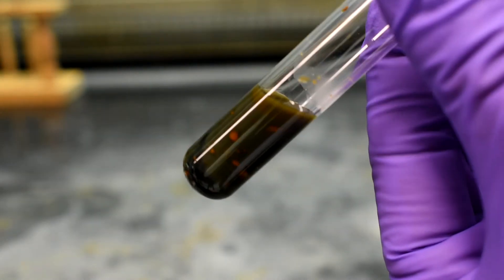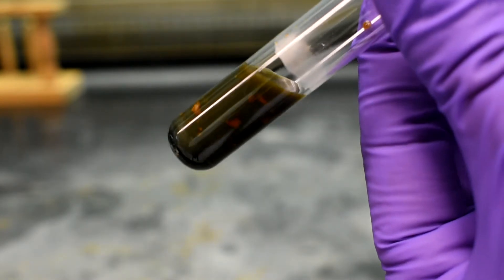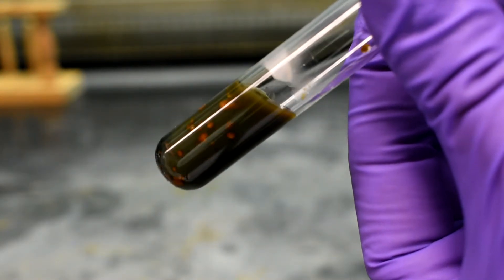In the presence of a nitro group, a rust-brown precipitate will form in the test tube after a minute or so.